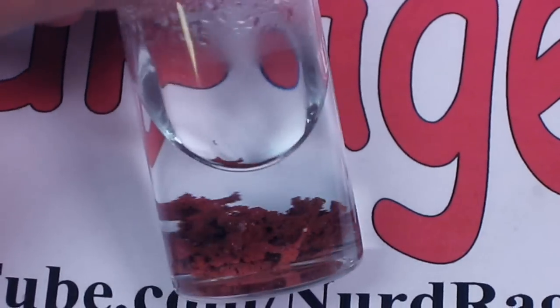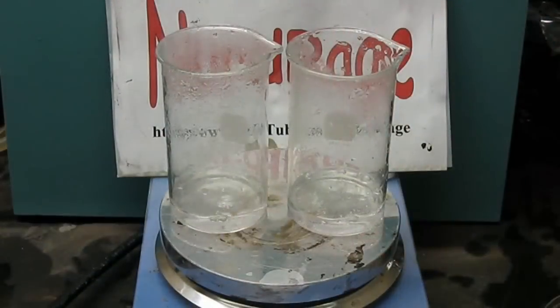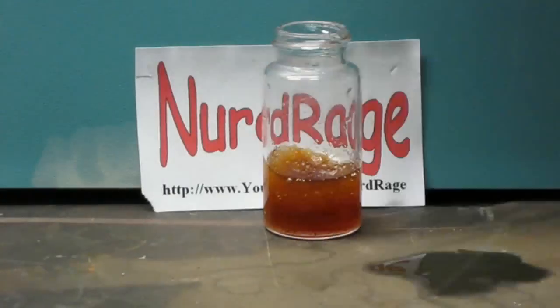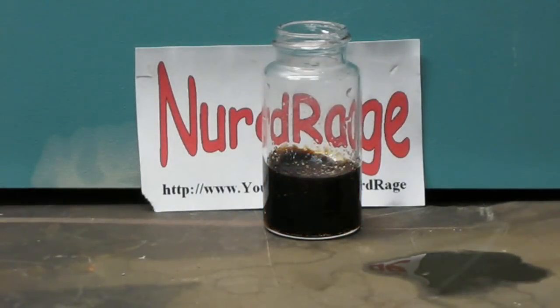Just filter off the copper and, similar to our previous video, boil down the dilute acid to concentrate it. It can be tested by mixing with sugar and seeing if it turns to carbon.